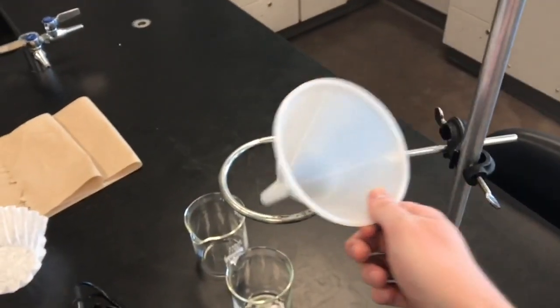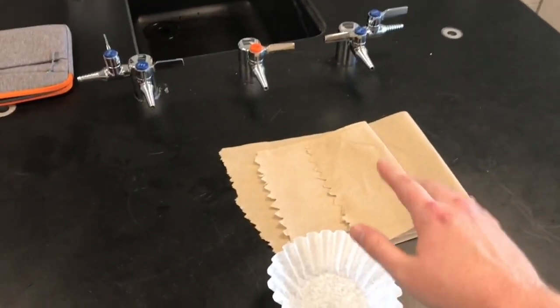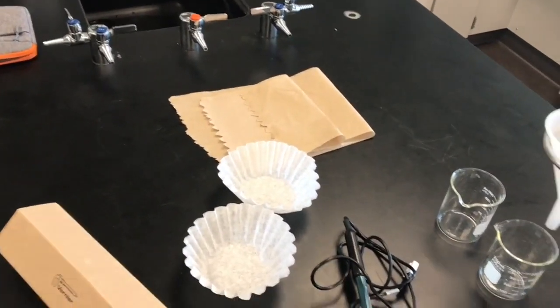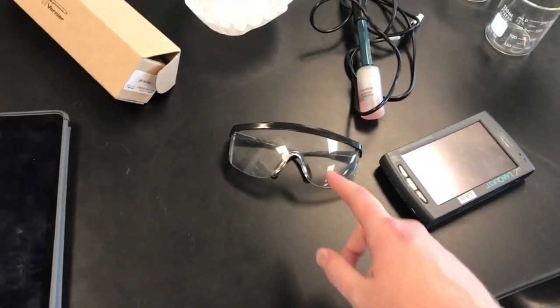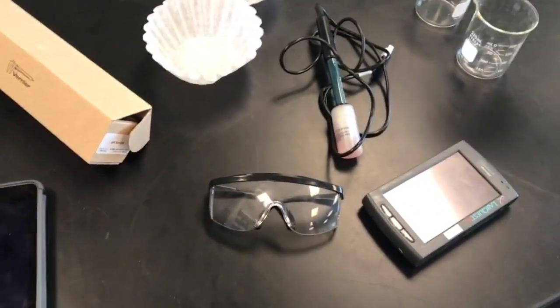So ring stand pole, I'll just put the funnel in right now. 2 coffee filters. You're going to need probably some paper towels. This lab gets a little messy. Or if we have towels in the room, grab a towel. And goggles. So everyone's going to need to wear goggles for this lab.